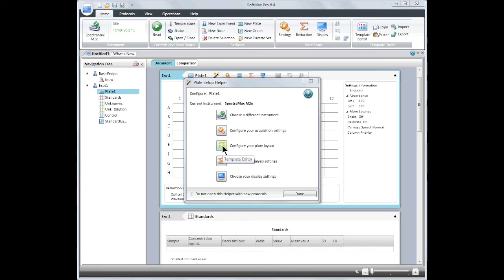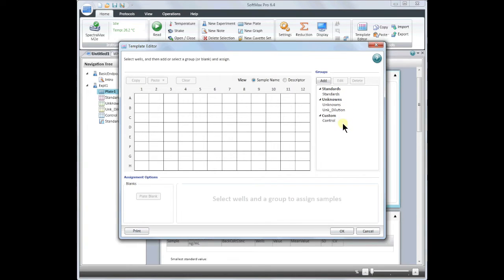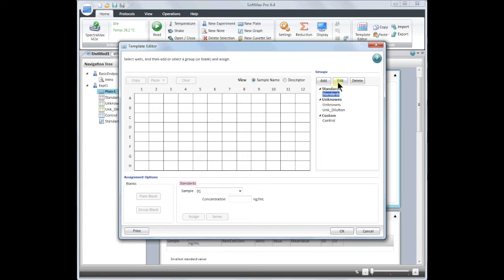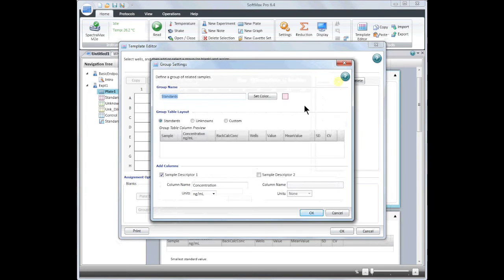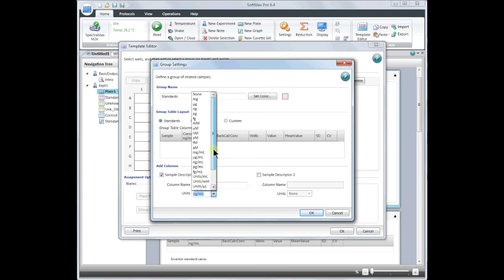Next, we will go to the template editor to configure the plate layout. The basic endpoint protocol contains preset groups. You may add new groups or you may edit existing groups. If I would like to change the units of my standards group, click on standards and then edit. From the pull down menu, you may select the units you wish to use.